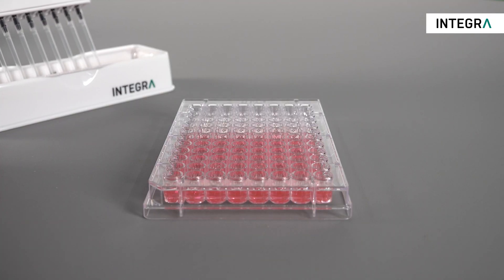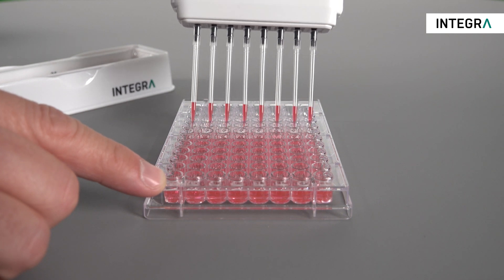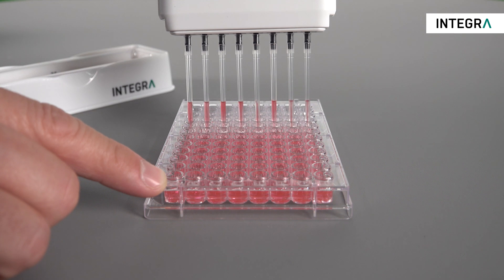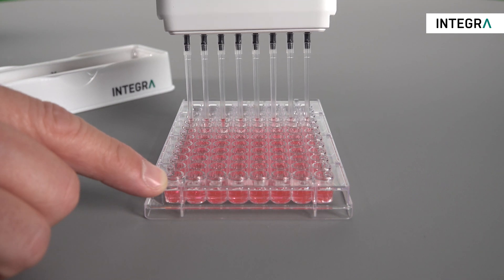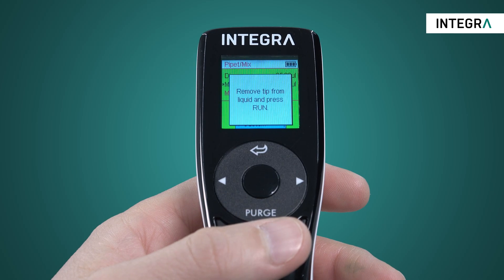Pressing run will start the first aspiration, and then pressing run a second time will begin the mix cycle. When finished, a blowout is automatically performed, expelling all liquid out of the tip, and the pipette will prompt you to remove the tips from the liquid and press run to complete the cycle.